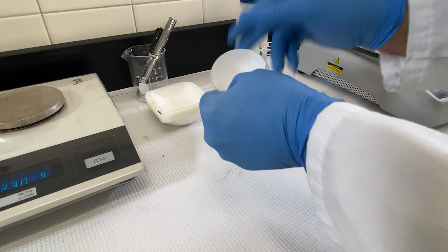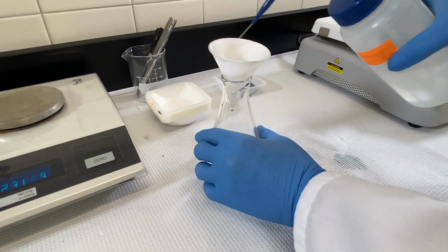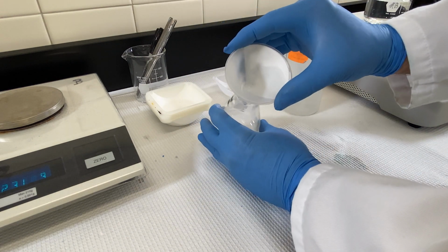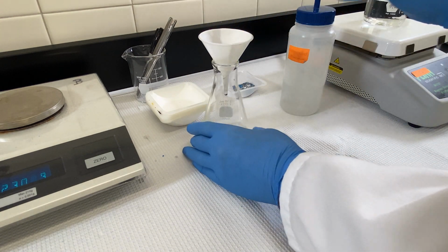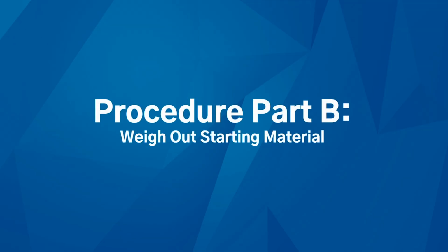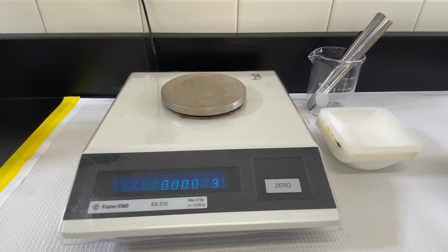Once the filter paper is folded into quarters, place it into the funnel and then wet it a little bit so that it seats, so that it sticks well to the funnel. The mixture that we're using is a combination of benzoic acid, copper 2 sulfate, and charcoal. And one of those is going to be our product.